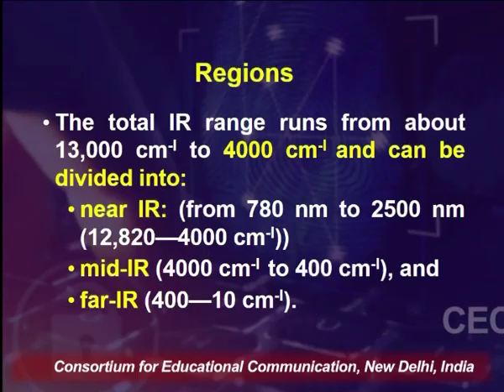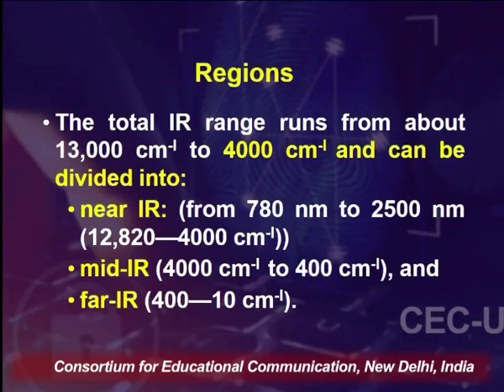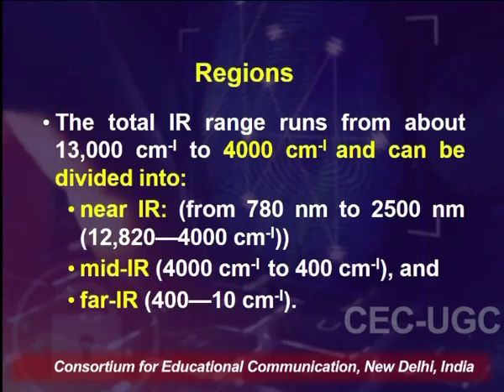The mid IR region is 4000 centimeter inverse to 400 centimeter inverse, whereas the far IR region is 400 to 10 centimeter inverse.